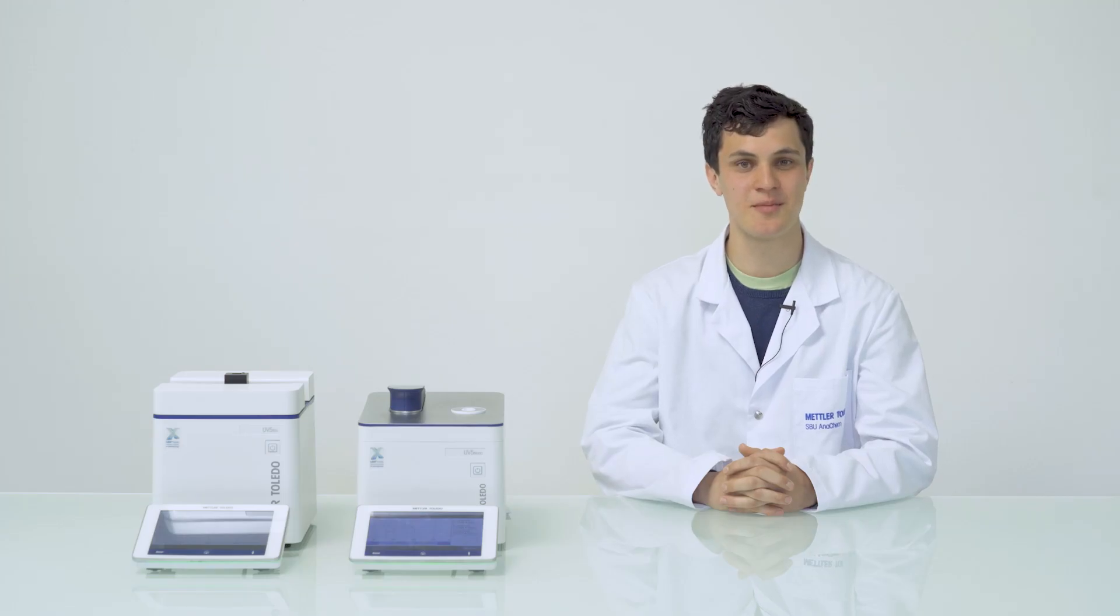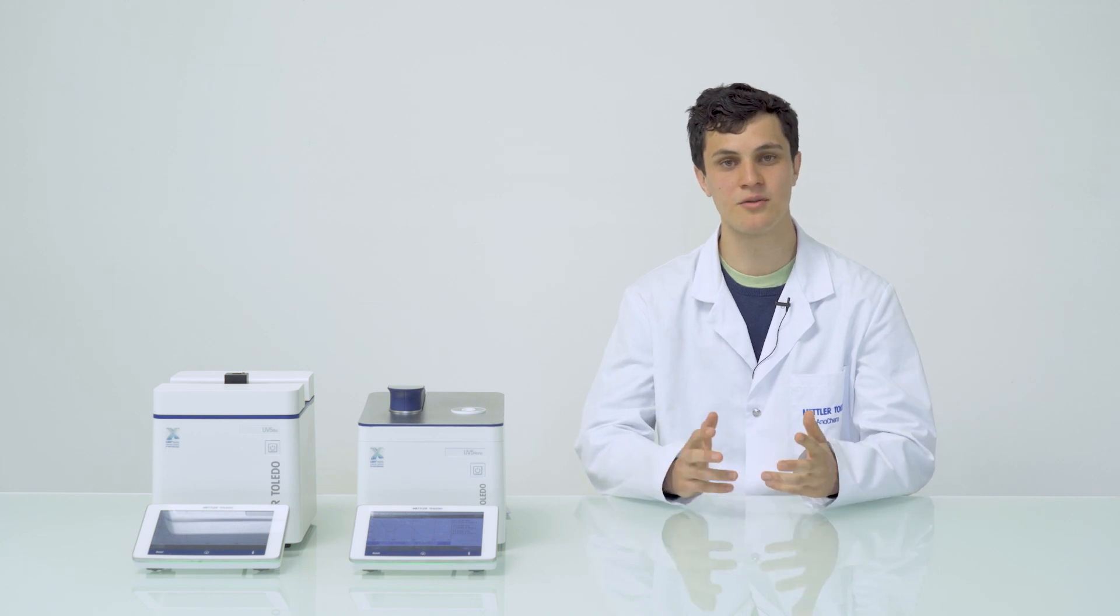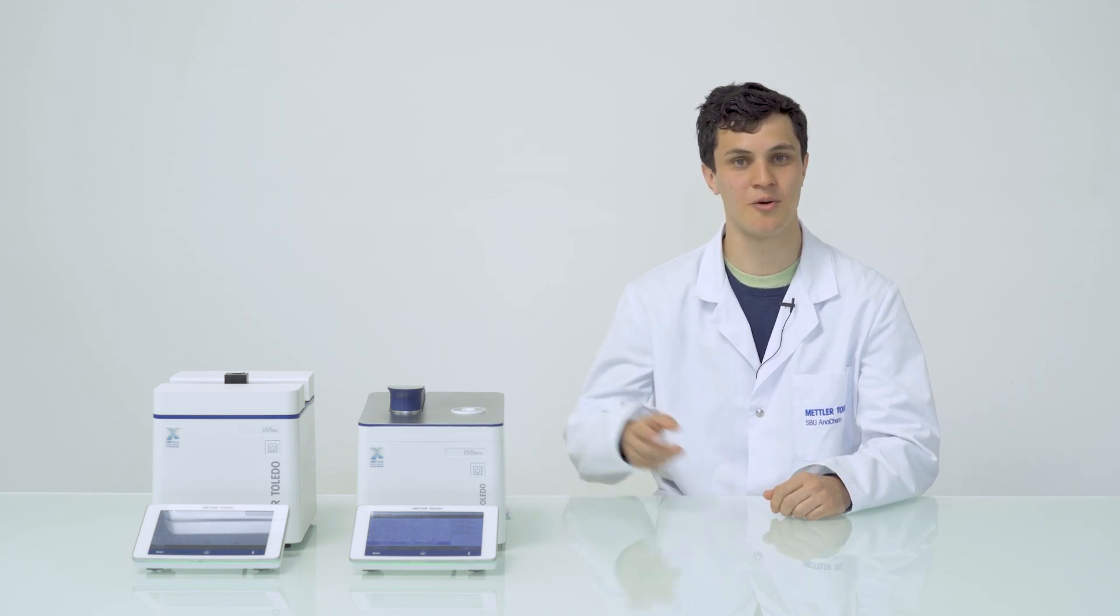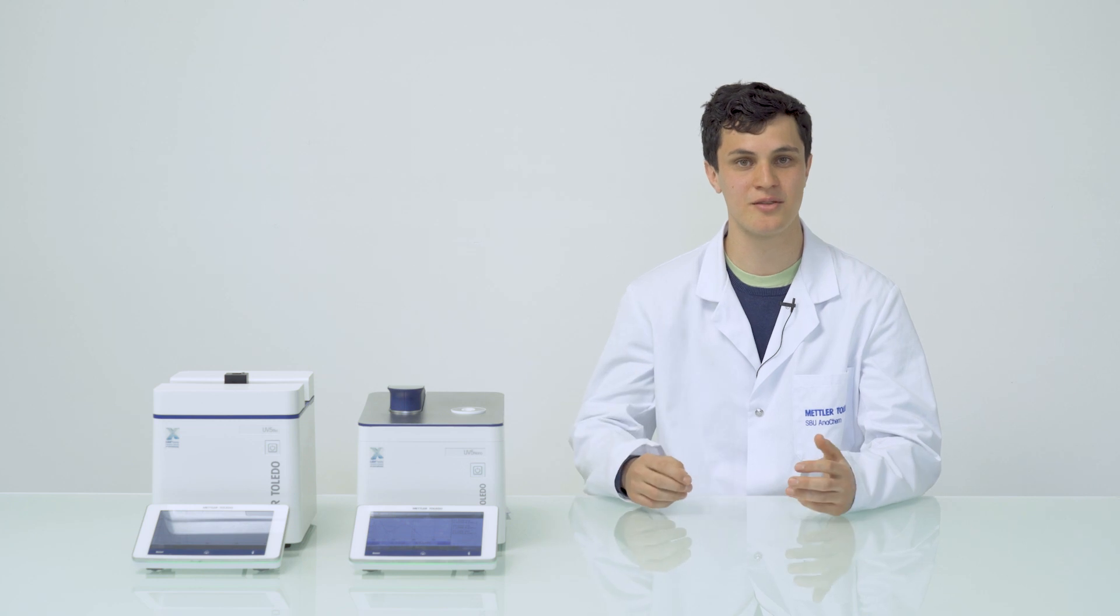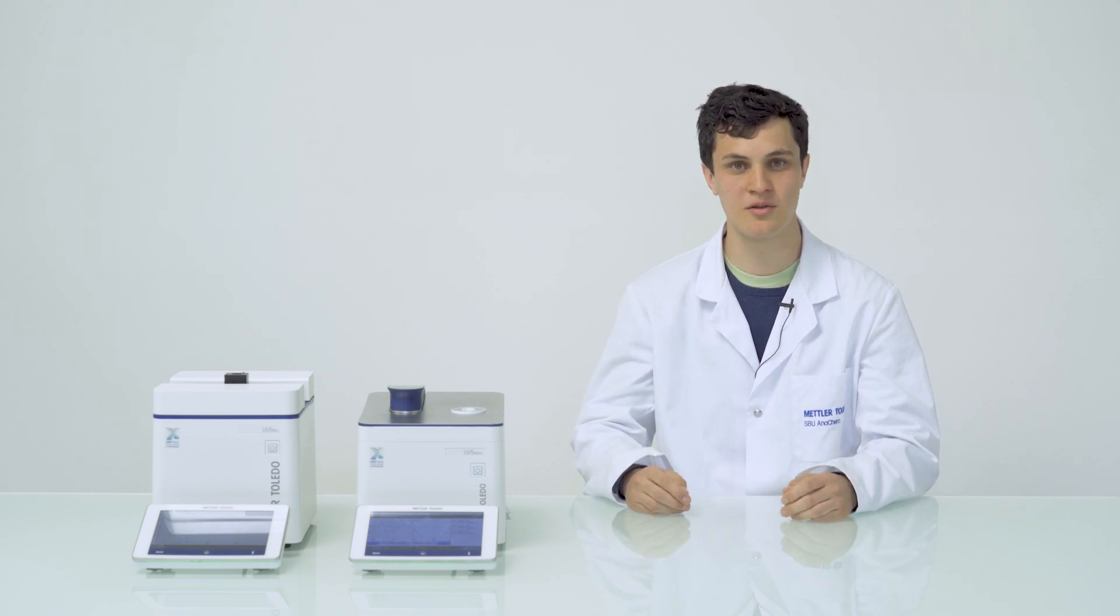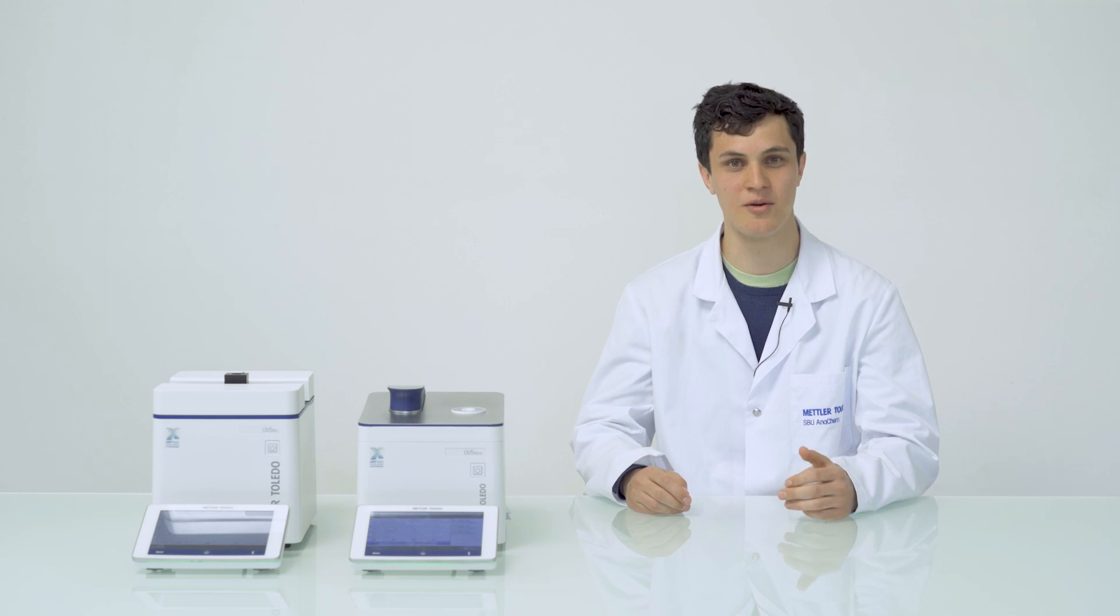In which other process steps of cell and gene therapy can UV-VIS be integrated? What other measurement parameters are critical to measure during the workflow? Download our new know-how package from mt.com to find out how UV-VIS spectroscopy can contribute to your new therapy.